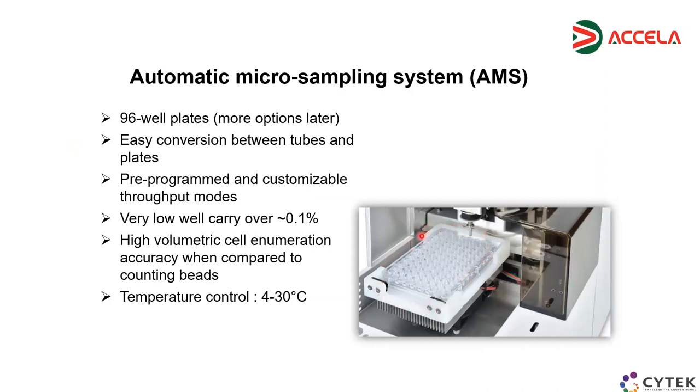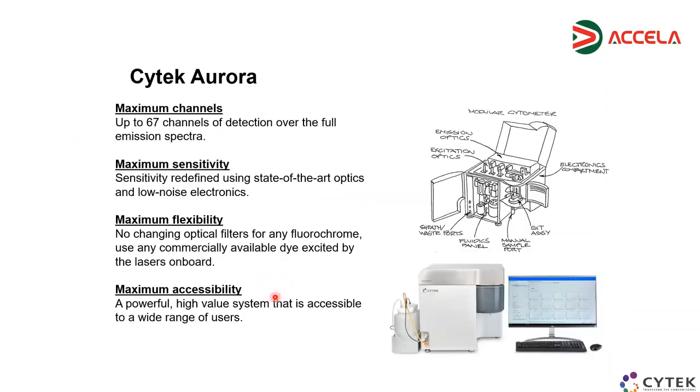This can be quite convenient for some delicate experiments. If you want to keep your cells refrigerated or heated, you can do so, yeah? So this is the overview of the Cytek Aurora.